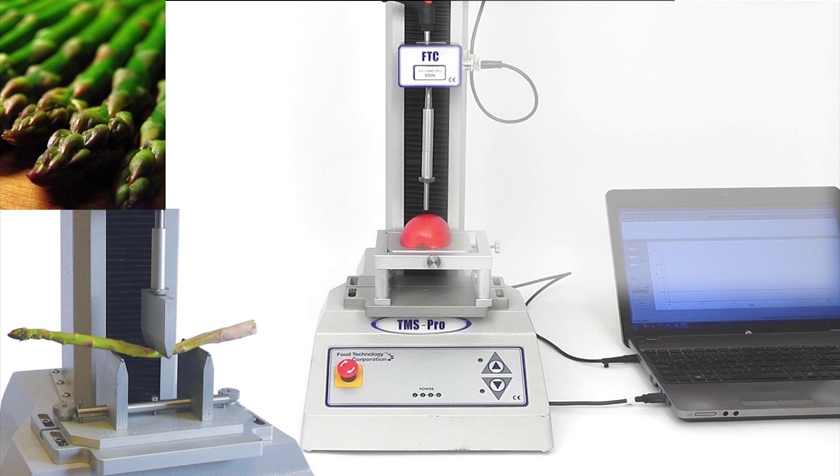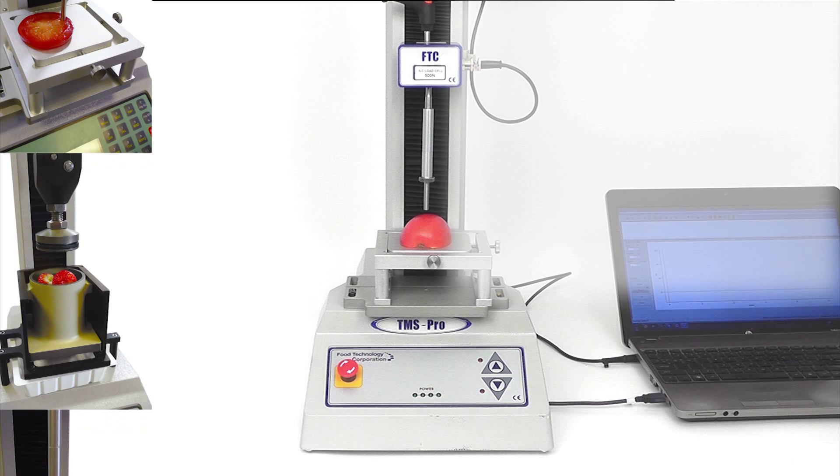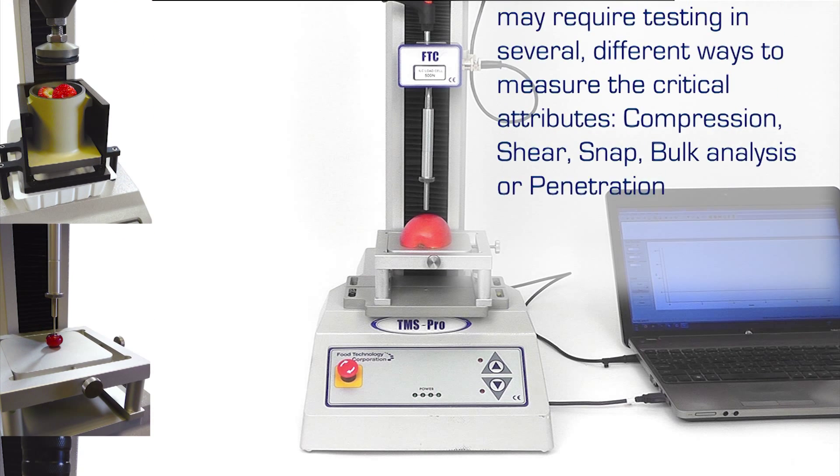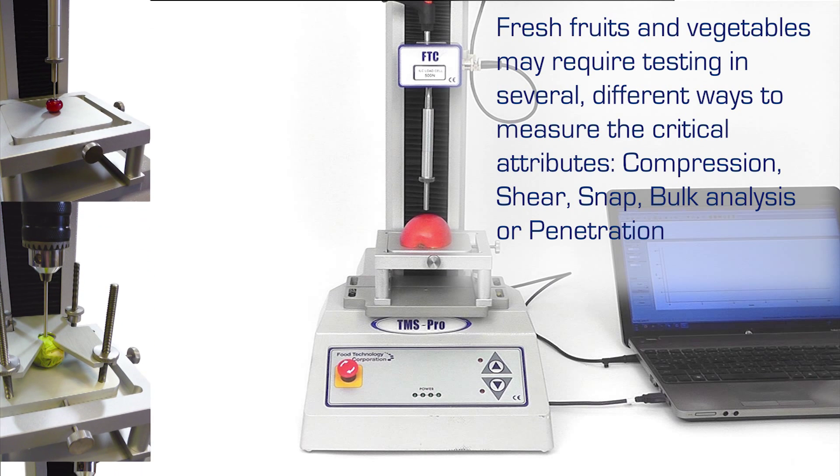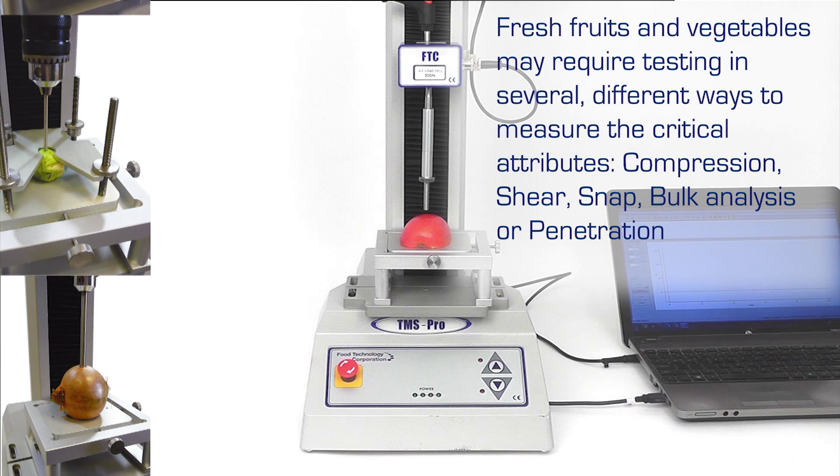A texture analyzer enables the measurement of attributes which reflect the consumer's experience by simulating the interaction. Compression, extrusion, shear, tension, penetration, bend and break - any or all of the ways in which the consumer interacts with a fresh piece of fruit may be simulated with a test method.